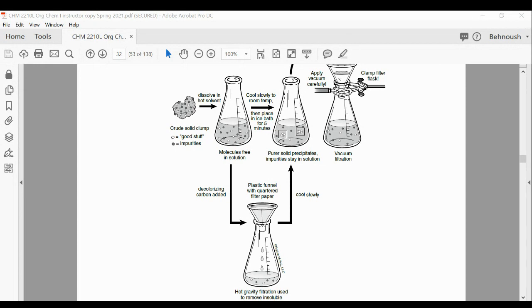Well, just that the sample is dissolved into the solvent. It's heated, and then it's filtered, and then the crystals are allowed to form. Okay. So dissolving the sample or crystals in hot solvent and recovering the crystals by cooling down in ice, right? Those are the 2 major steps.